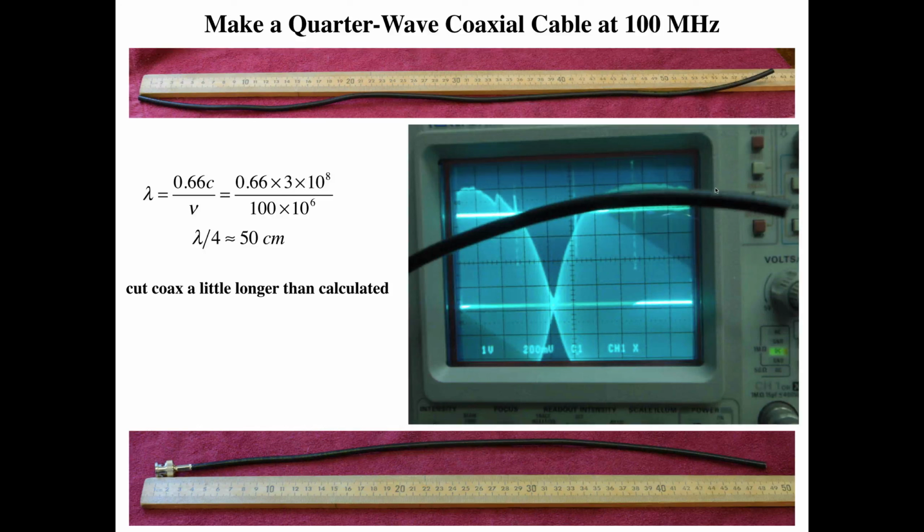What I'm going to do is start cutting. So here's my cable. It's hooked up to the T, and there's the 50 megahertz marker. There's the 100 megahertz marker. And you can see the dip is below, about 80 megahertz or so. So I'm going to start cutting this, and you'll see that this dip starts to move towards the 100 megahertz marker. I'll leave the pointer here. That's my starting point, and then you'll see me start cutting the cable.